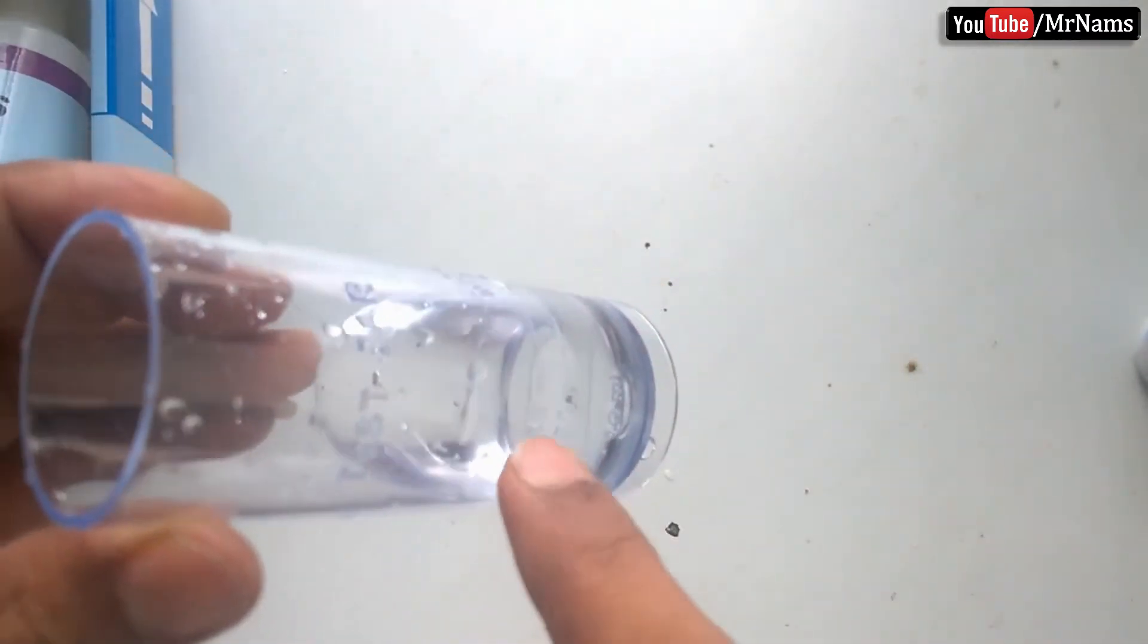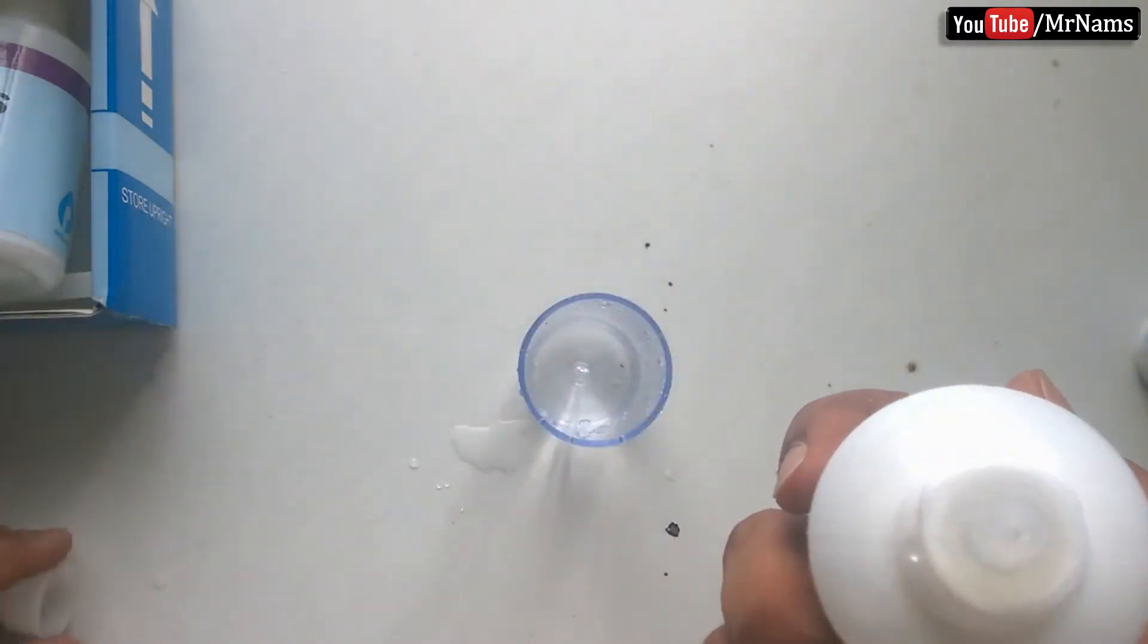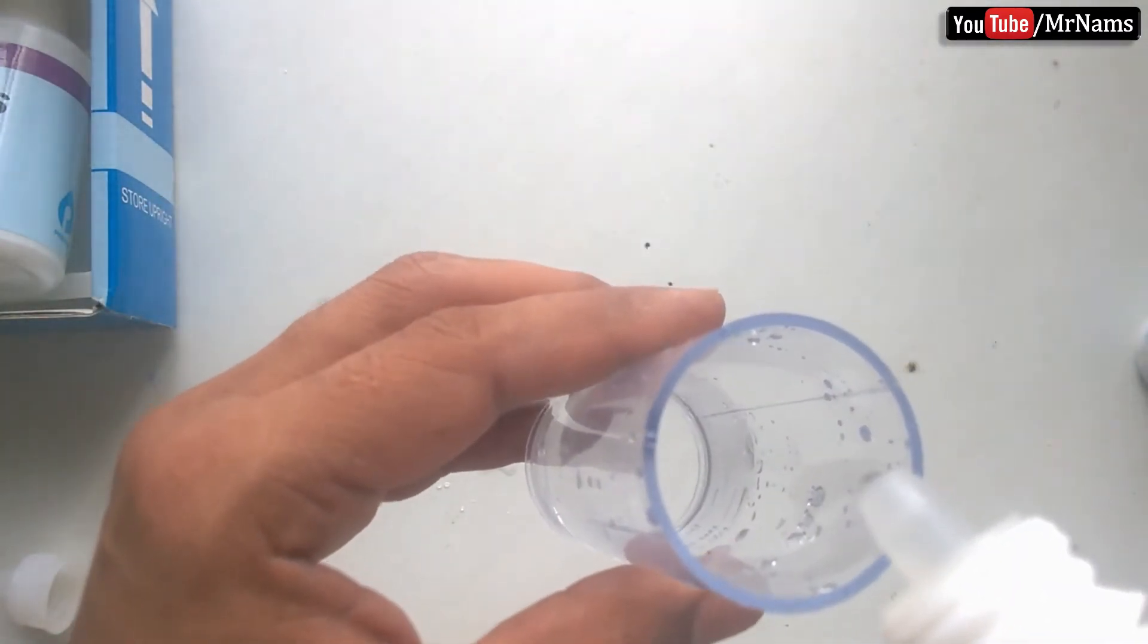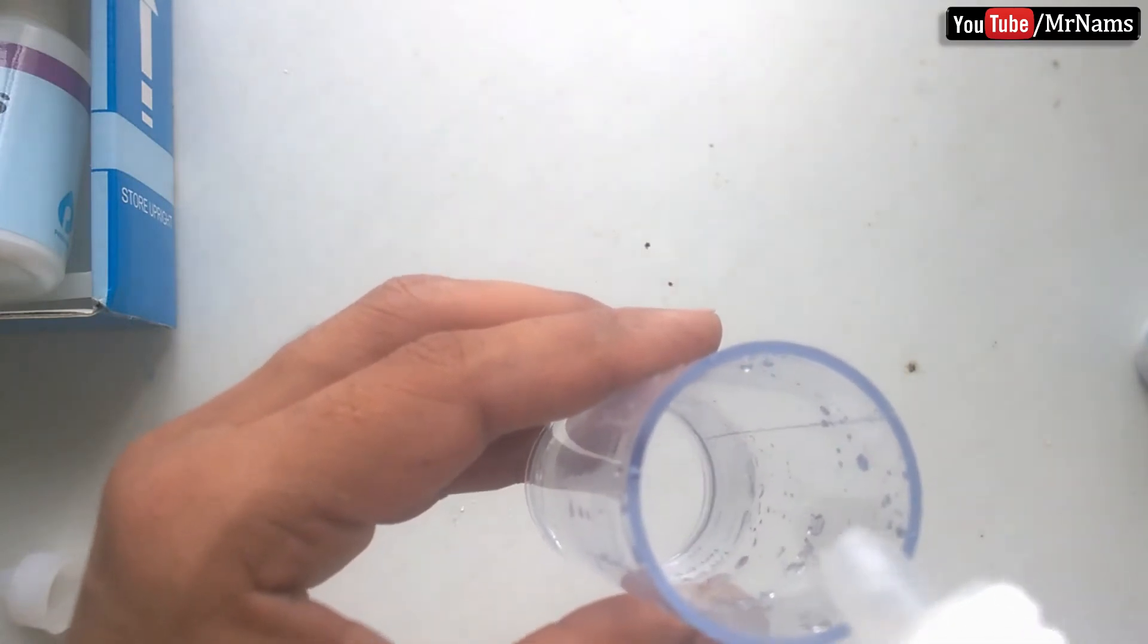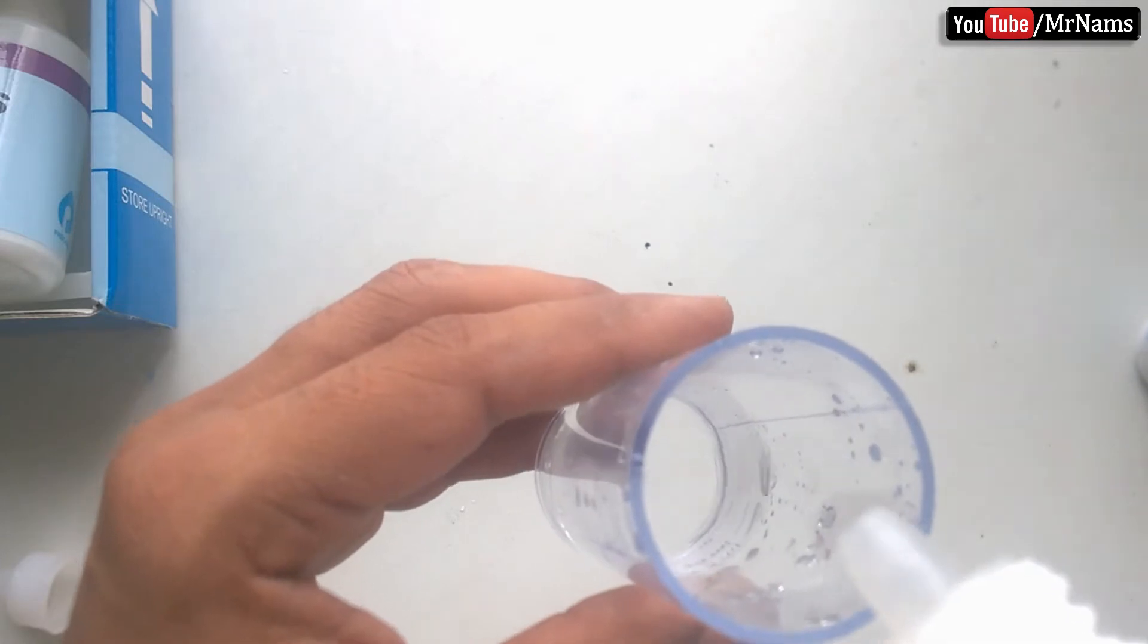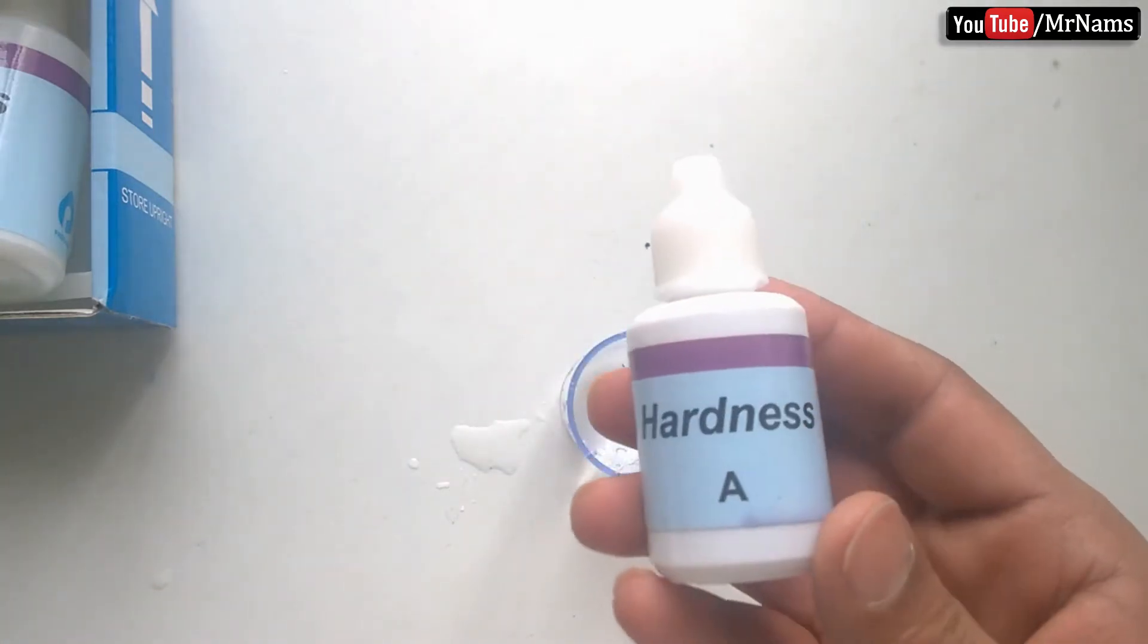Take 25 ml water in test jar. Add 10 drops of reagent B. Add few specks of reagent A powder.